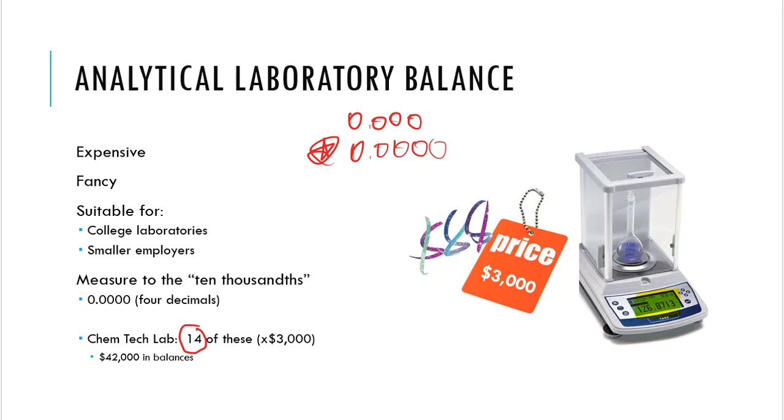And these were actually a mistake. Oh, this was a mistake on my part. Because when I had quoted balances for the college to order, I actually wrote down accidentally the wrong item number when I sent that order through. And the way that the college works, we ordered it, that particular amount was approved, and we received them. When we realized that only 3 digits were there instead of 4, we could have sent them back, but we would have lost out on that money. We were not able to order different balances because those were a little bit more expensive, and that is not what the college approved. So because of that, we would have forfeited our order.